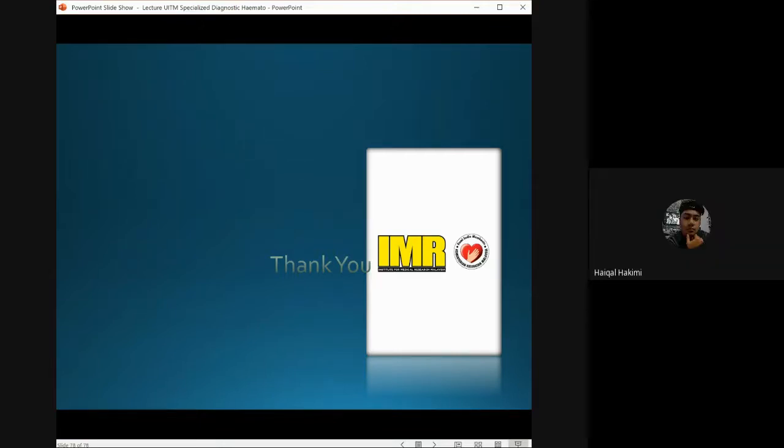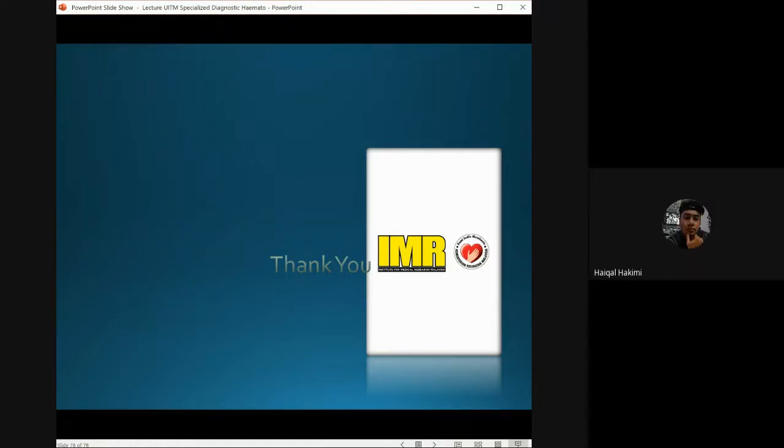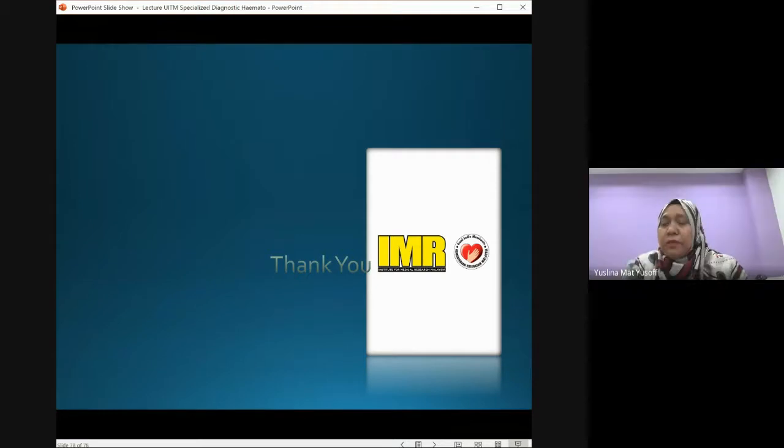Hello, Assalamualaikum. Salam. Saya nak tanya berkaitan dengan lymphoma. Saya nak tahu advanced lab test yang guna sekarang, sebab saya baca kat Google macam confused juga. Oh, lymphoma dia memang complicated sikit. Dari segi lab test tu, masa ni dia banyak through immunophenotyping yang macam I tunjuk awal tu, flow cytometry tu kan.